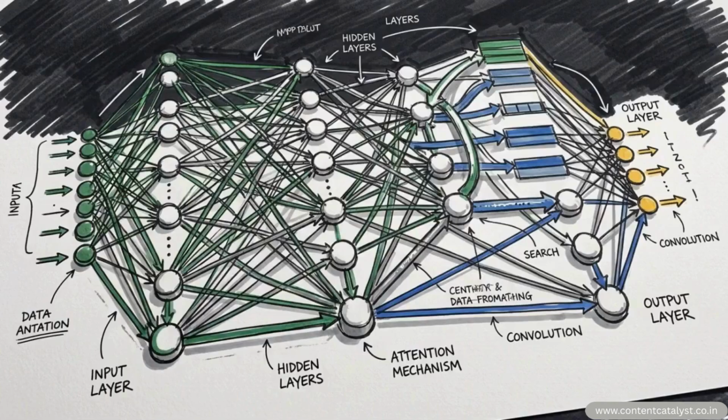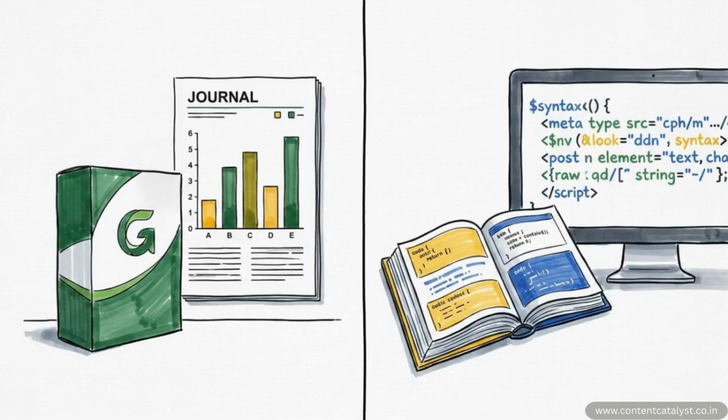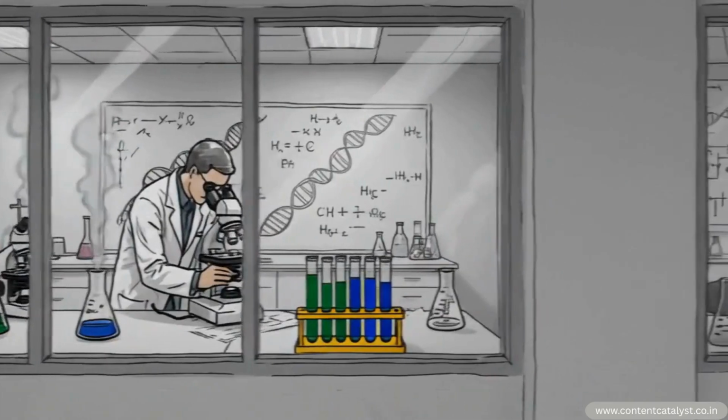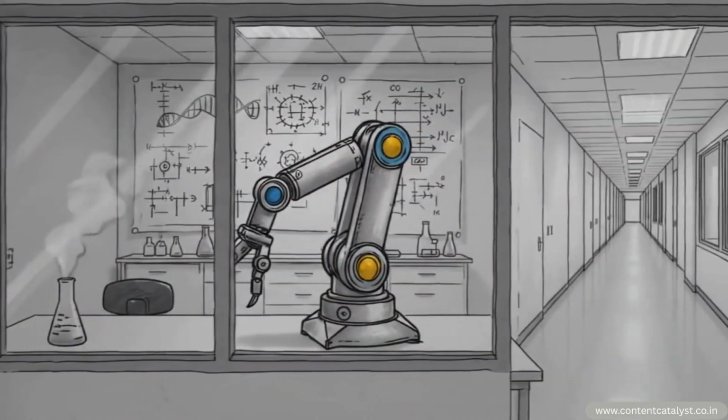Python does offer limitless visual customizability and direct integration into broader machine learning pipelines, things Prism simply isn't built to do. But for the average life scientist trying to submit a paper, the pragmatic speed and built-in journal compliance of Prism easily outweigh the need to tweak every single pixel with code. So, who exactly should be buying this software? The utility of the tool depends entirely on your specific academic discipline.